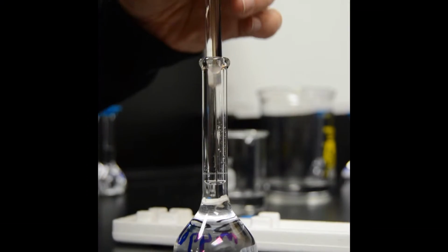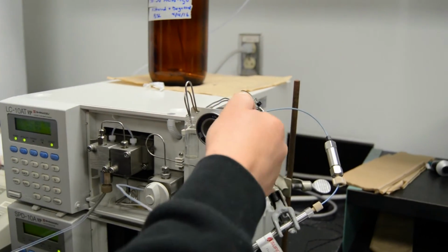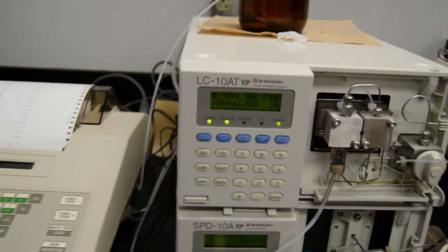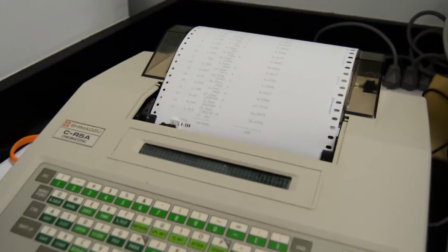Once the sample has moved through the column, it reaches a detector, which is set to a certain wavelength, where the data is then transferred to the peak integrator. The peak integrator forms a chromatograph of the sample. The sample is then discarded in a waste container.